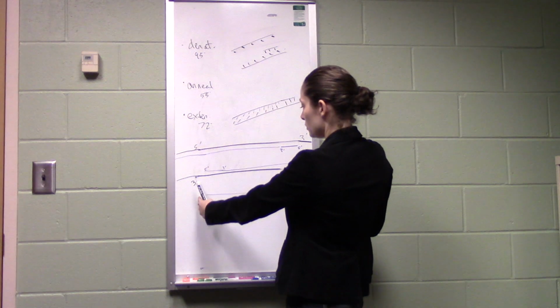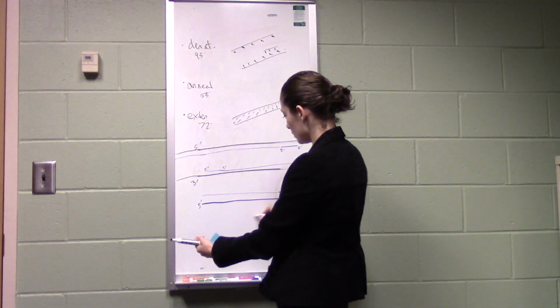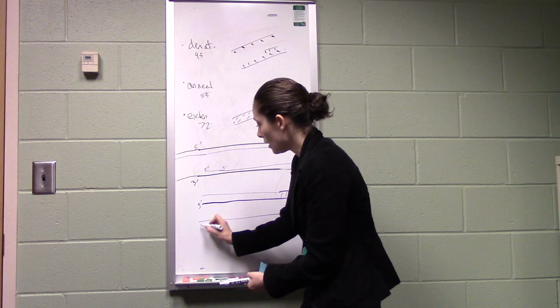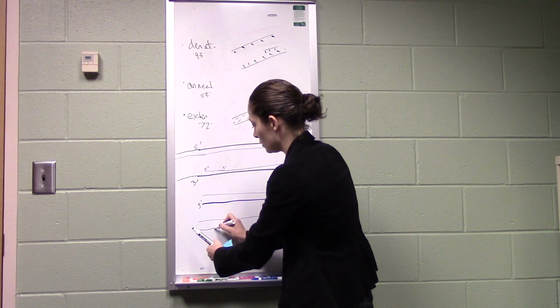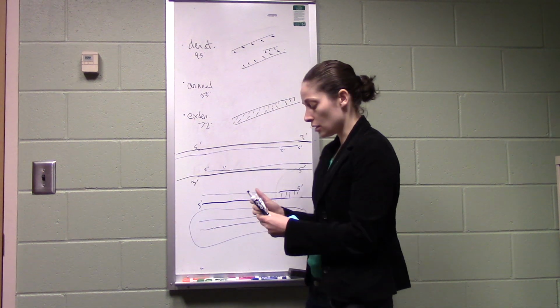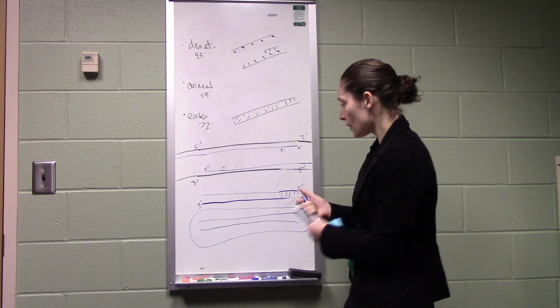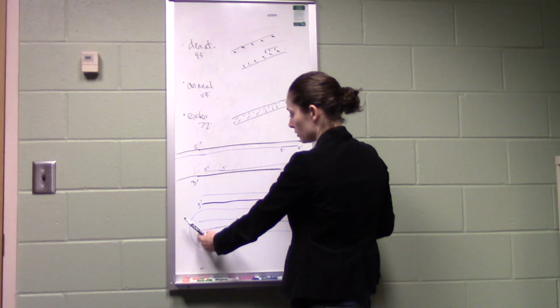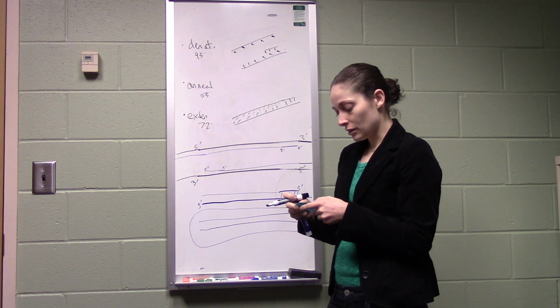Okay, so now we've created our final product, and all products based off of this, right, on the next round, we start with that, and now we have this primer coming in, binding right at the end, and it'll copy the whole thing. So this is what the vast majority of our sequences will look like at the end of a PCR reaction. They'll be from primer to primer, okay? And the primers are part of the product. Don't get confused about that.